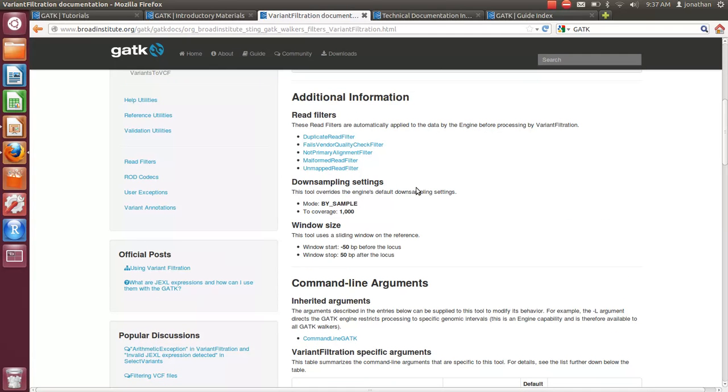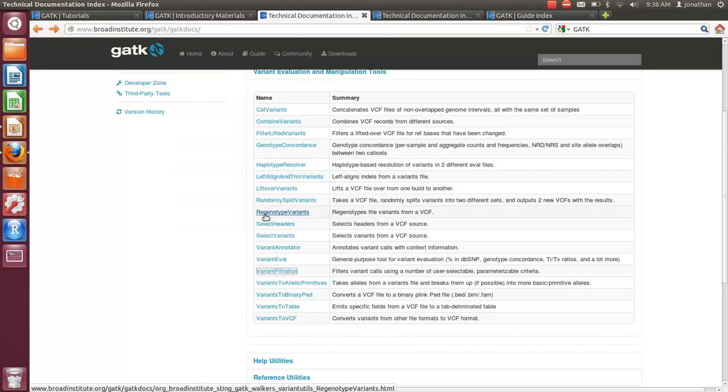This is the way that you apply filters to a VCF, where you mark individual records or rows, that is SNPs, that meet certain criteria, like the overall depth being at or below a certain level, or the variant quality not being up to standards. You can mark that, and then you can use another tool called SelectVariants, which allows you to actually conduct the hard filtering if you desire to remove certain classes of SNPs from a VCF. I'll be showing you how to do that.